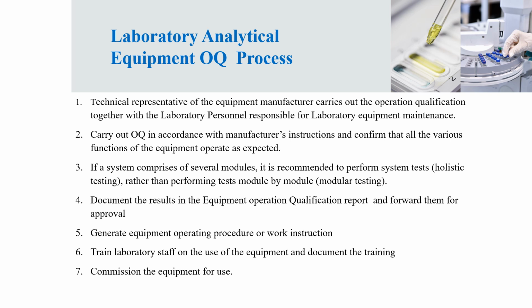Then commission the equipment for use, meaning the supplier or the service provider hands over the equipment to the laboratory for use.